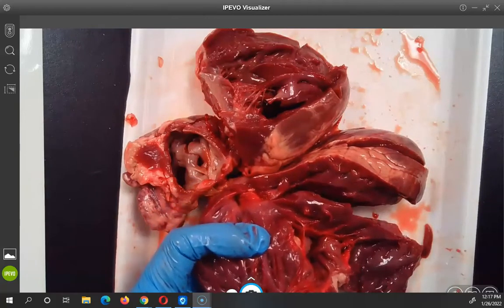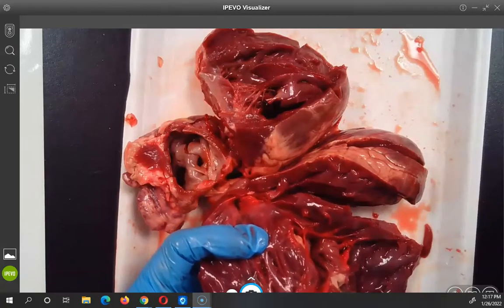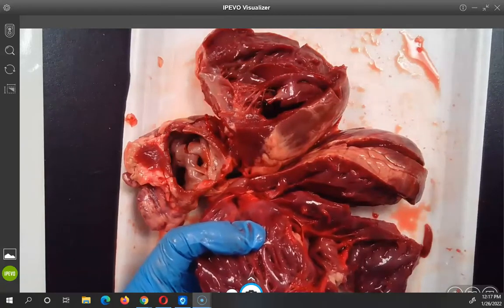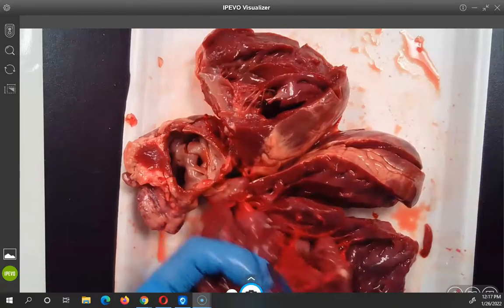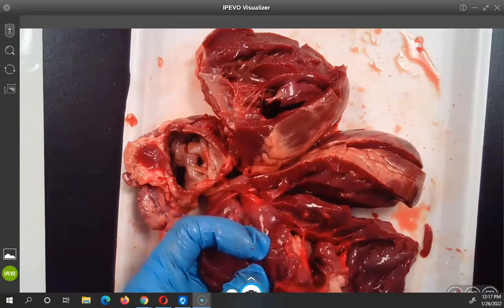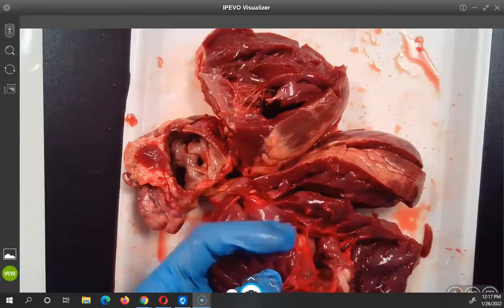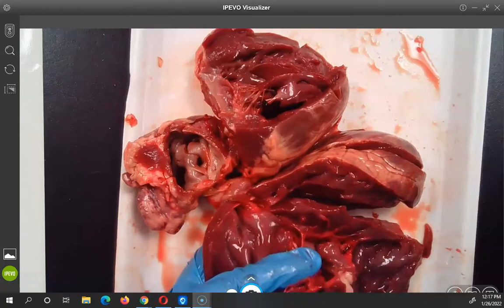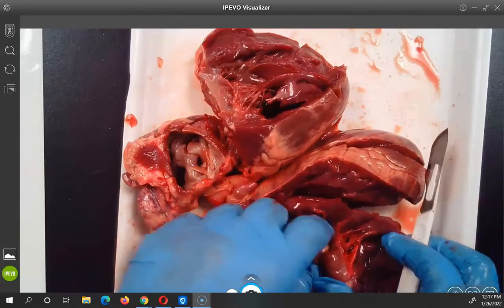It's not the smell, it's just my head hurts. Make sure you get some air when we go out. I think this was perfect timing because then we get to go to music. All right, good — then he gets a break. This is nice and sinewy — it's a little harder to cut through. My stomach's not doing good because of that, but it's cool to watch.